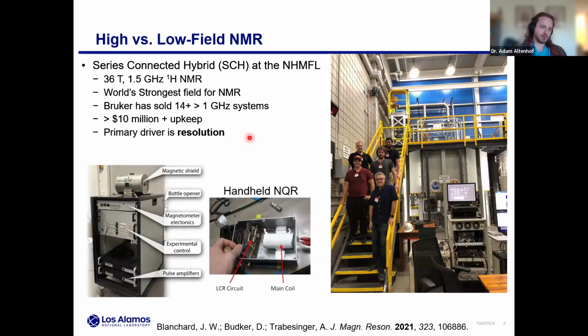To offer the alternative perspective, in this review article from John Blanchard, he's describing the average low field NMR instrument. You might have your main magnetic field for detection, your RF shielding, your spectrometer, maybe your tuned circuit, your RF amplifiers, and look at this. It all fits on a cart a few feet tall. It's on wheels. It's portable. There are no cryogens. You just need to plug this into your power source and away you go.